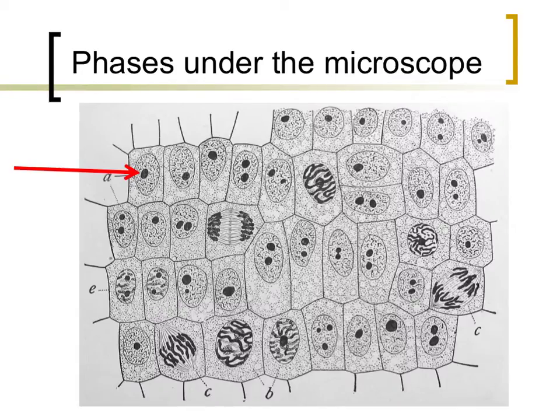Interphase is characterized by a seeming lack of activity. Since the sub-steps of interphase take a tremendous amount of time, most of the cells that you would find underneath the microscope would be in interphase. The cell designated on this slide is in interphase. One or two nucleoli are usually observed during this phase. Distinct chromosomes are not visible during this portion of the cell cycle as DNA is in the form of chromatin.